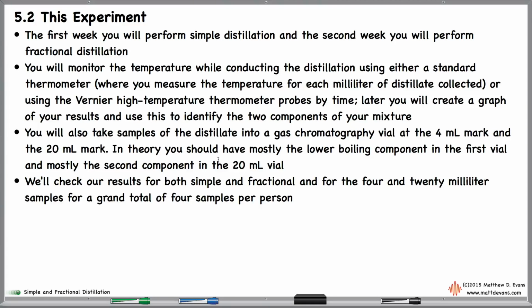It's going to be all leaking out the sides, and it's going to be really stinky. All right, so we're going to check those results for that simple and fractional distillation using gas chromatography. That's going to be a separate talk about how gas chromatography works, but that's what's going on in this experiment. In a lot of ways, this is a much simpler experiment compared to, say, chromatography, which we recently wrapped up.